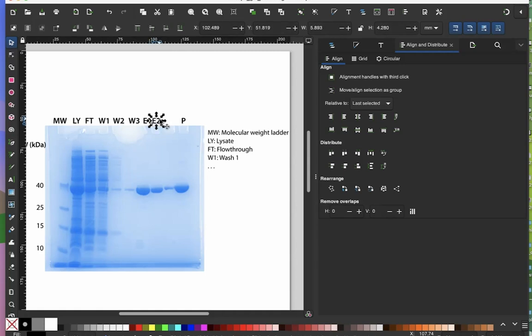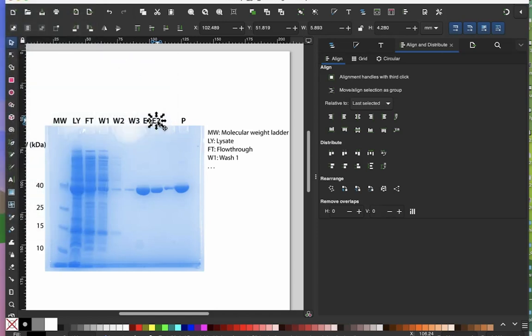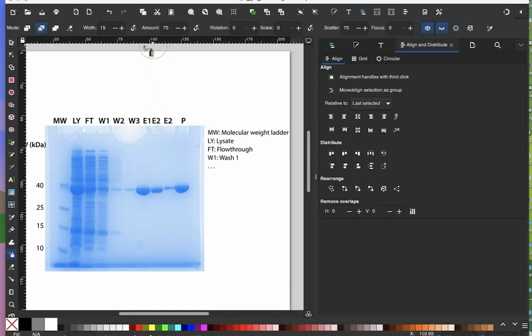Another shortcut is you can paste in place. So if I come over here and I do Command C, and I want to paste in place, if you go to Edit and you see Paste, you see various options. So this is telling me I can use Command Option V, and that'll help allow me to paste in place, or I can just click there. Now, if I do Control, I can just drag this over without having to realign things later.